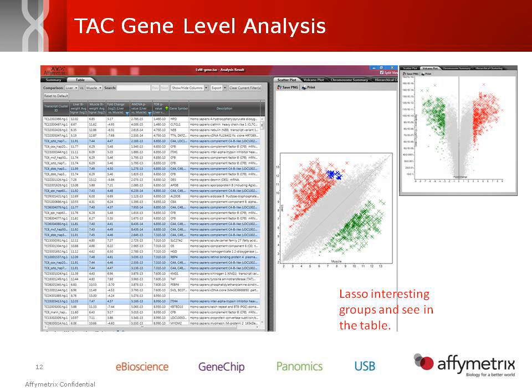So if you have genes of interest, pathways of interest, and you want to see how did they fare in the experiment, we go to the table. You would pick your pathway, your genes of interest, whatever the case may be, and let's see if they were upregulated or downregulated based on the scatter plot to the right. This is very usable. This is very nice software, and what many people find valuable is it's free.